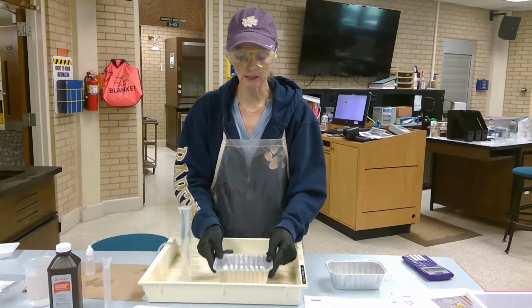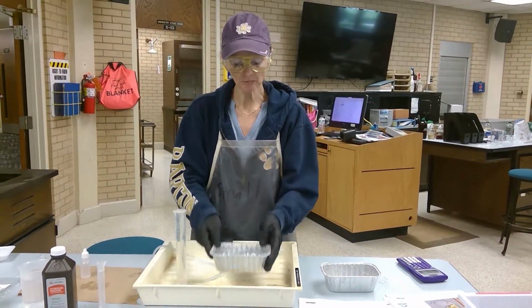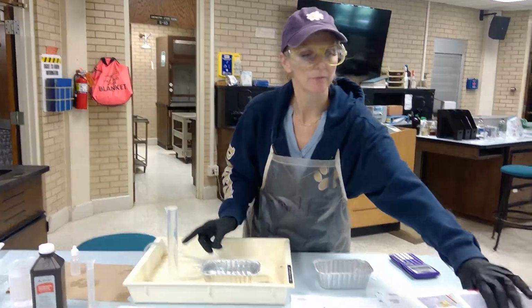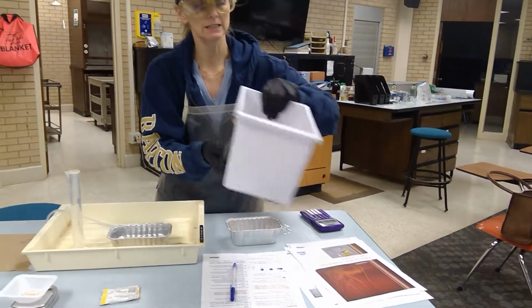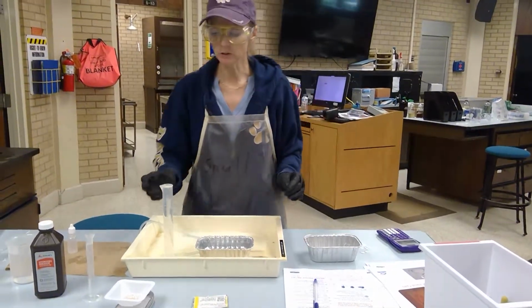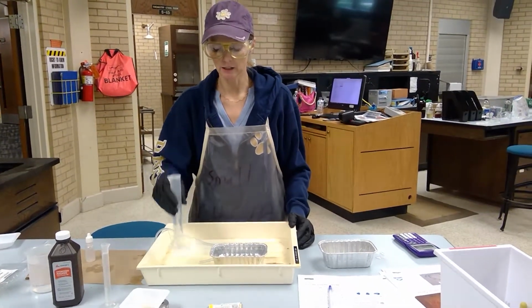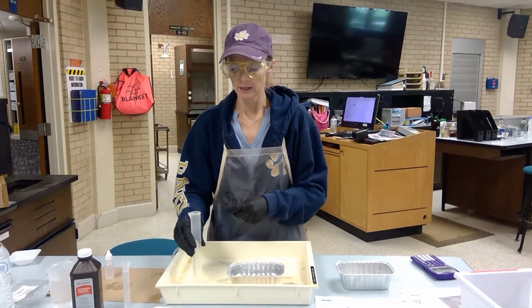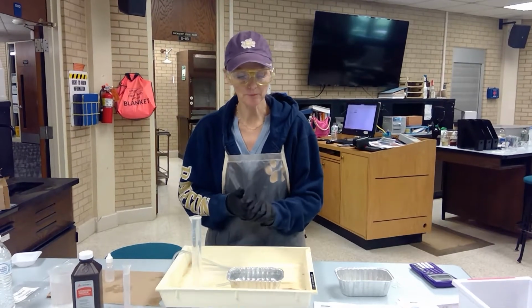If you have a cake pan that is deep, I suggest that you use this. You can use a plastic container, because what you're going to be doing is inverting this graduated cylinder to collect your gas, okay?